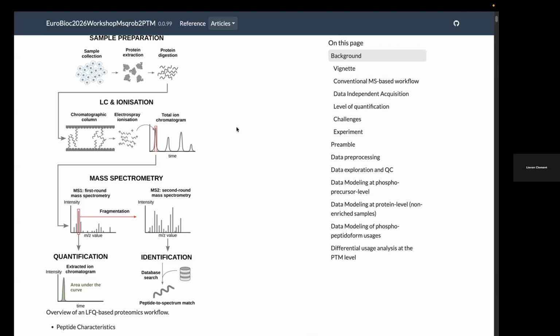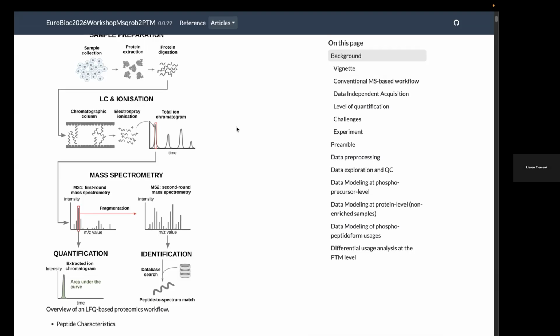Another thing that we also have is missing data. Sometimes a peptide does not fly well through the mass spec, and if the protein is not really abundant, we are below the detection limit of the instrument. So we have messy data, missing data, and all of these things. And that's nice to work on as a statistician.